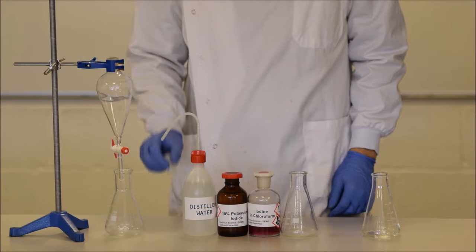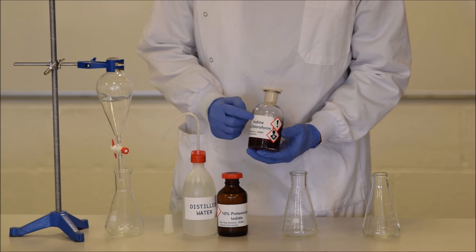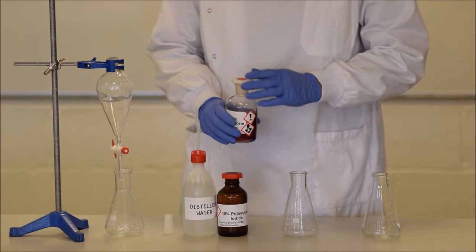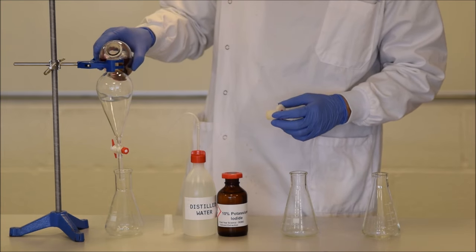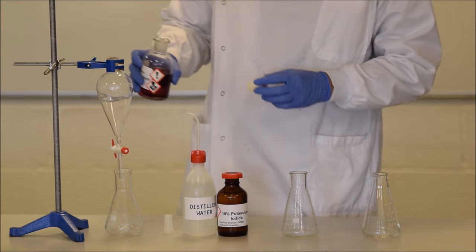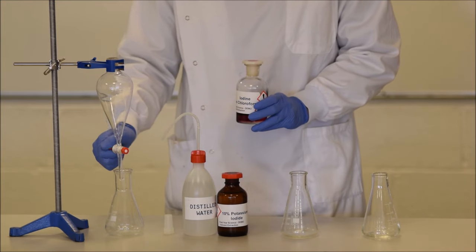Next, what I'm going to use is chloroform, which is contaminated with iodine. So I'm going to try and extract the iodine out of the chloroform. And so now I'm going to pour it into the separating funnel. Before pouring anything into the separating funnel, you should stop and check. And the reason that you always put the conical flask there first is in case you don't make this check and you make the mistake.